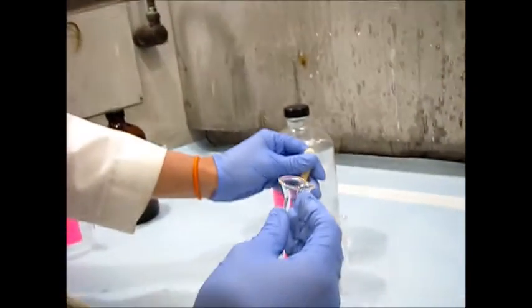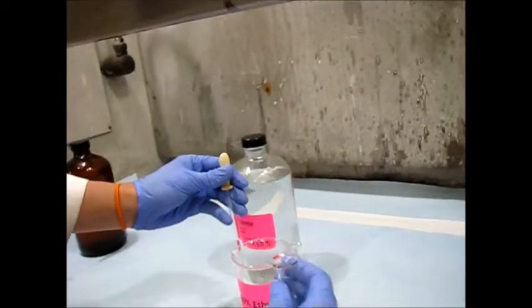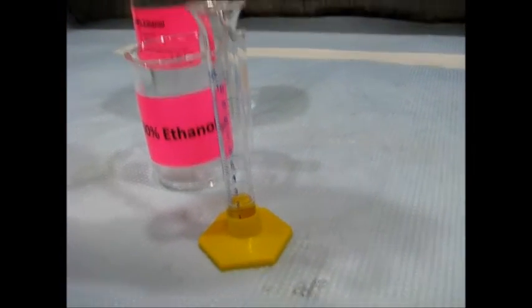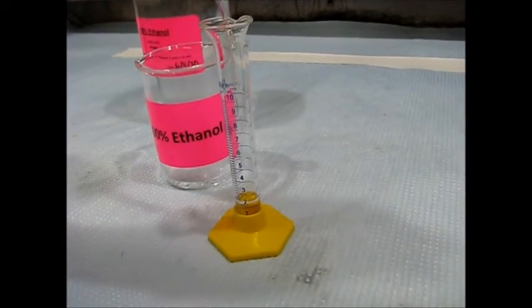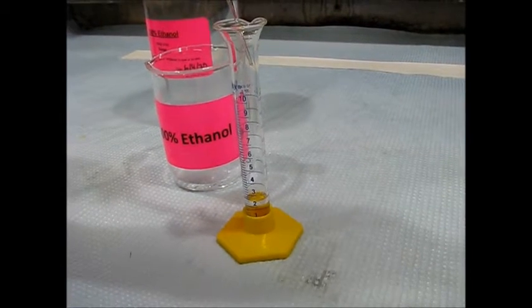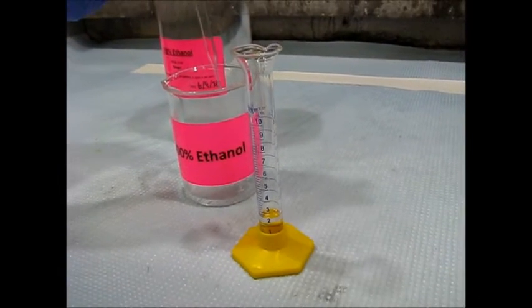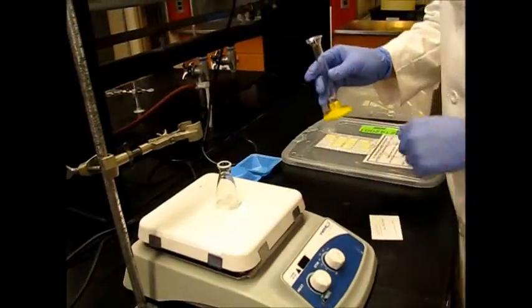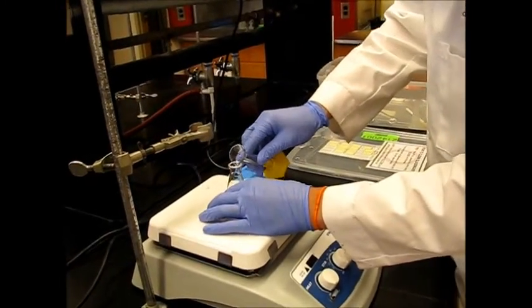About just right at 2 right there. So now we're going to add half a mil. And that's good right there. So we're going to take this and we're going to use it as our solvent for our reaction. We'll be running the reaction in this 25 milliliter Erlenmeyer flask. Go ahead and pour this in here.